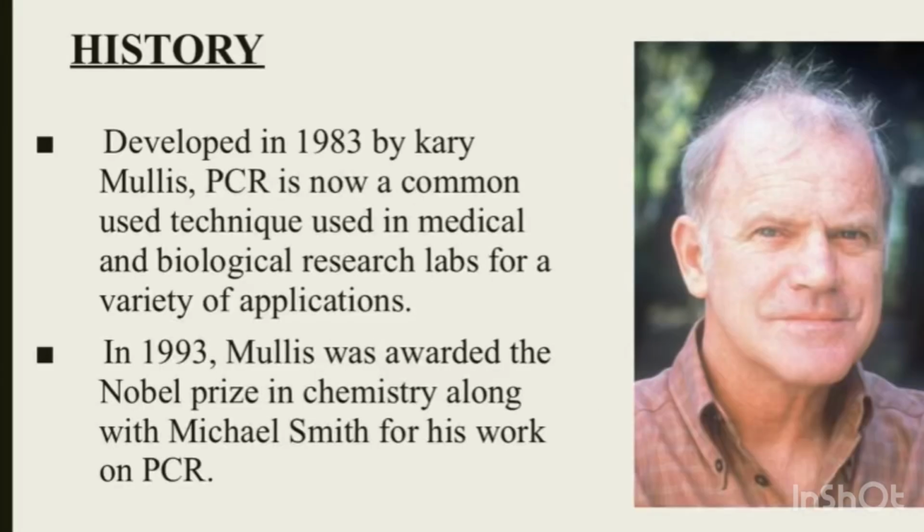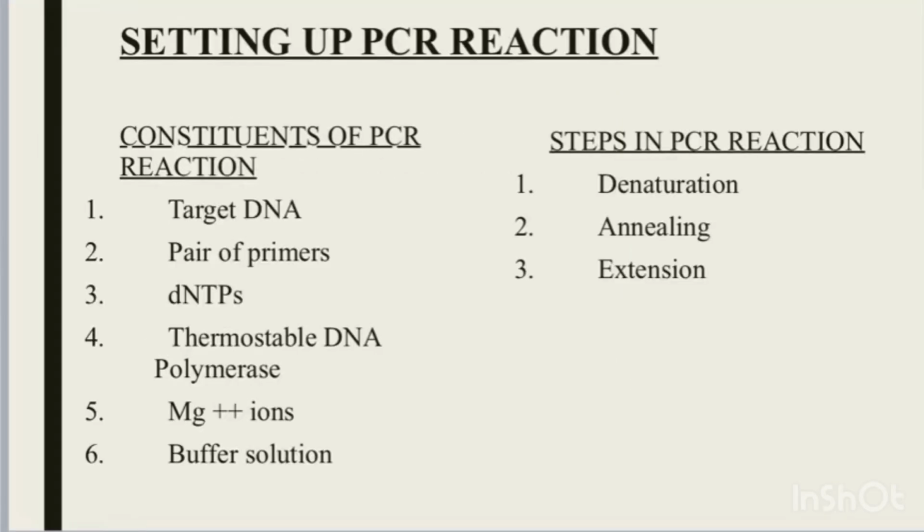Also, if you look at the history, it was developed in 1983 by Kary Mullis. PCR is now a very commonly used technique in medical and biological research labs for a variety of applications. So let's talk very briefly about setting up a PCR reaction.